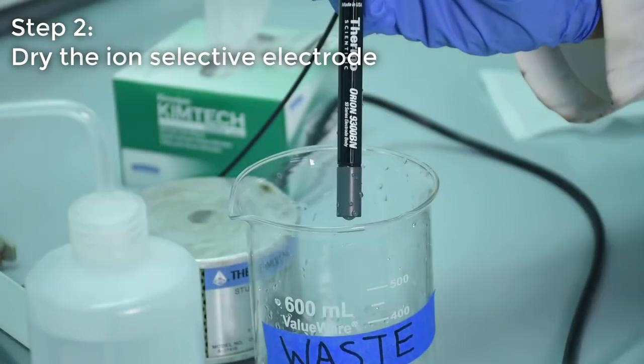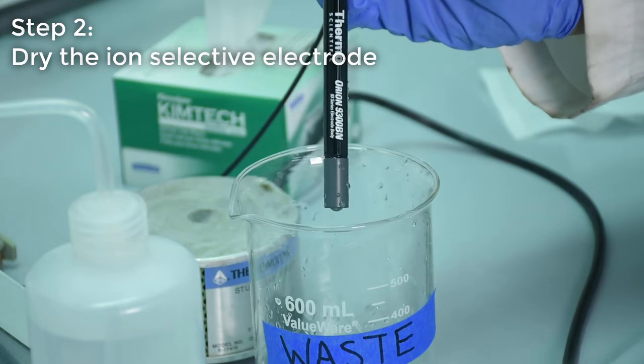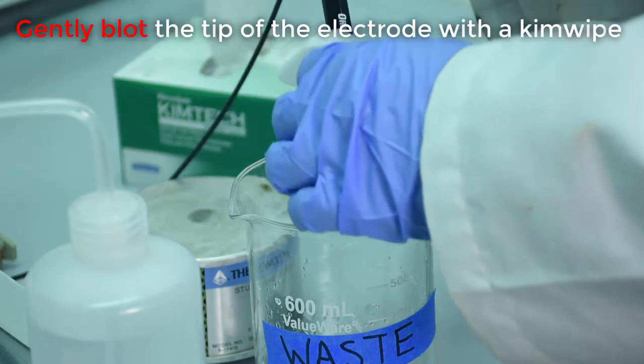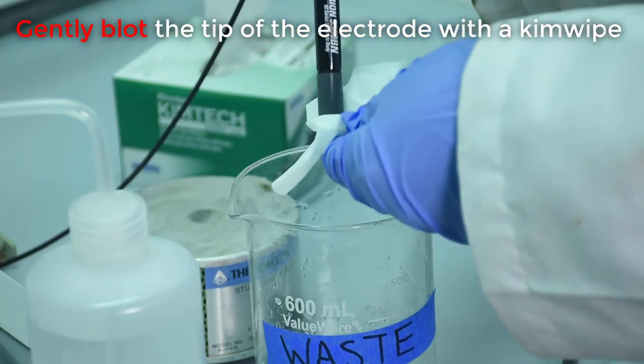It is important to dry the ion selective electrode to avoid diluting the sample with water from the washing step. It is crucial to blot, but not wipe, the tip of the electrode to avoid damaging the ion selective membrane.